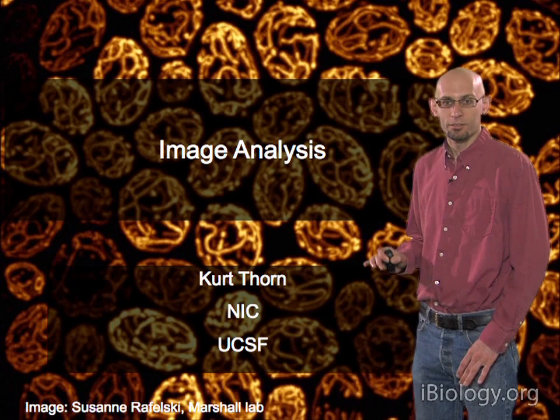And how does this work? So it turns out actually in ImageJ, there's many, many different algorithms it can use for doing automatic contrast or automatic threshold generation. But the most common one you'll see used probably is what's called Otsu's method. And this basically works by assuming your image is made up of background pixels and foreground pixels, and that those are both roughly Gaussian distributed. And it looks for basically the minimum between those two distributions and then sets the threshold there.